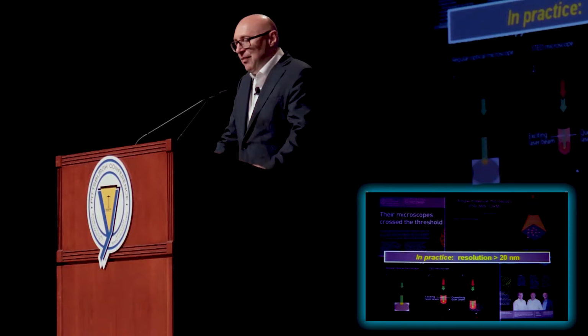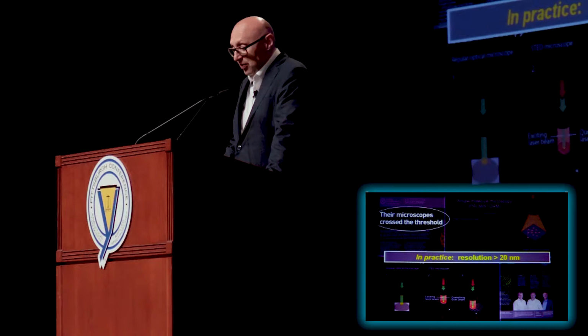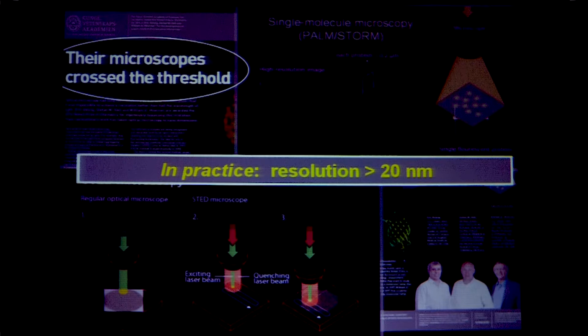And when I started out looking into this problem many years back in the early 90s, of course, my dream was to get down to a spatial resolution that is really at the size of a nanometer. And so at the time the Nobel Prize was given, it was clear that in principle, you can achieve a spatial resolution of the size of a molecule, a nanometer, but not in practice. So the Nobel Foundation actually put it quite correctly: the microscopes really crossed the threshold, but did not attain the ultimate limit. So this is what I put here.